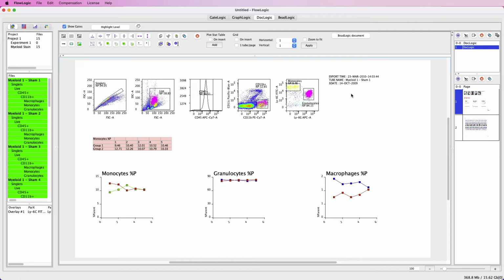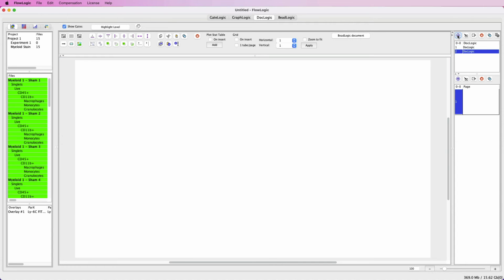And these can be very useful if you are generating and applying global analysis templates, because when you apply your template to a new dataset, the metadata displayed in these keyword text boxes will update automatically to show the information for the current file. There are also some very useful grid settings.